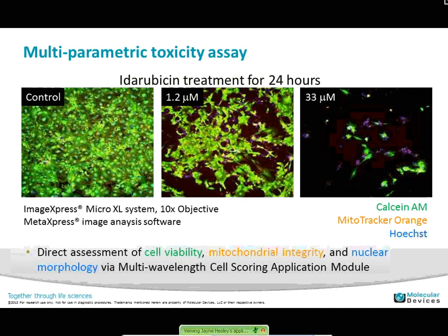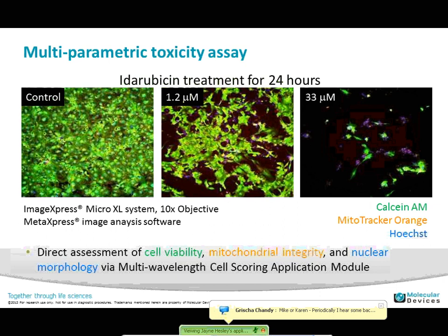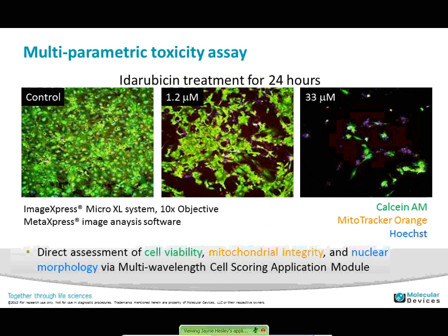For multi-parametric toxicity on cardiomyocytes, the cells were stained with CalceinAM to show cell viability, MitoTracker Orange to show mitochondrial membrane potential integrity, and Hoechst for nuclear morphology and cell segmentation. The control wells show high viability, visible mitochondria in orange, and nuclear counts for cell segmentation. With increasing doses of doxorubicin over 24 hours, you can see effects on both cell morphology, cell density, and integrity of the mitochondria.